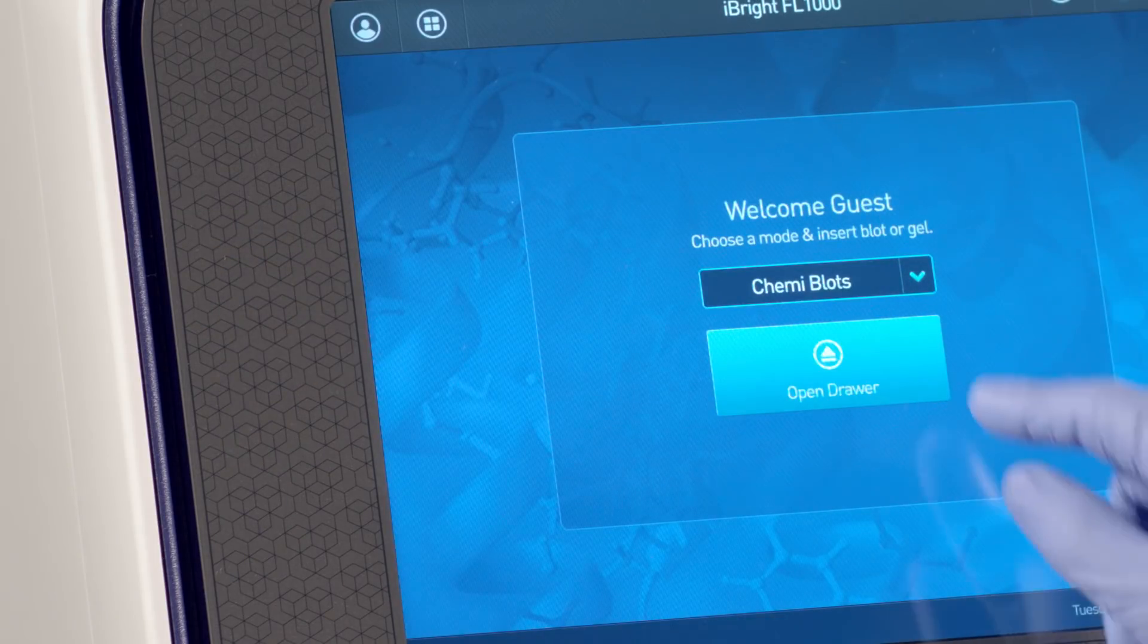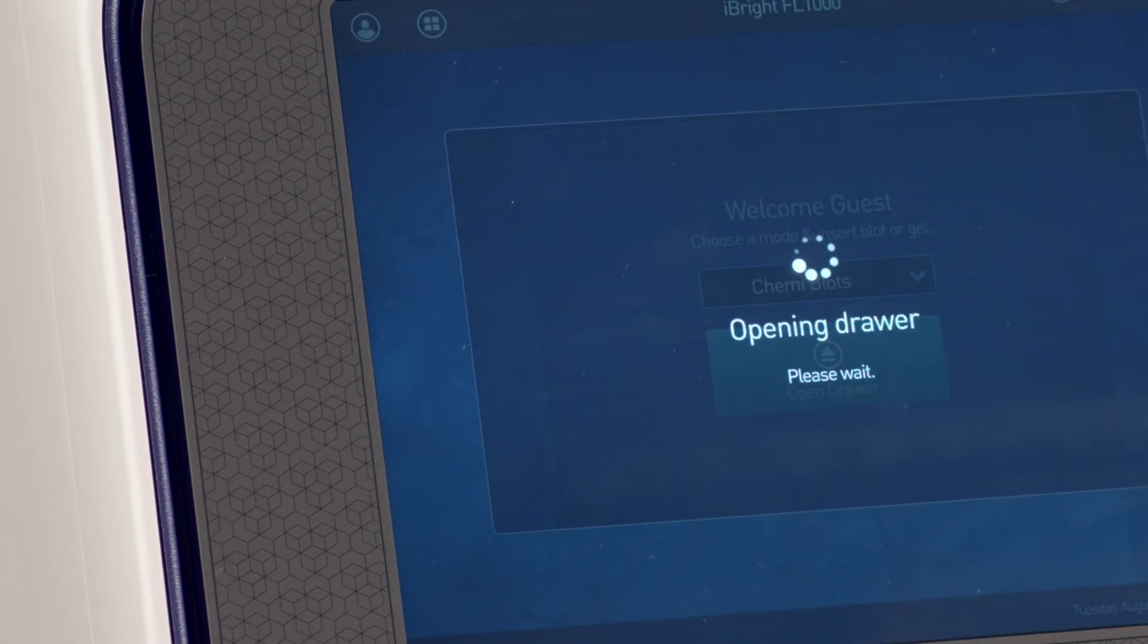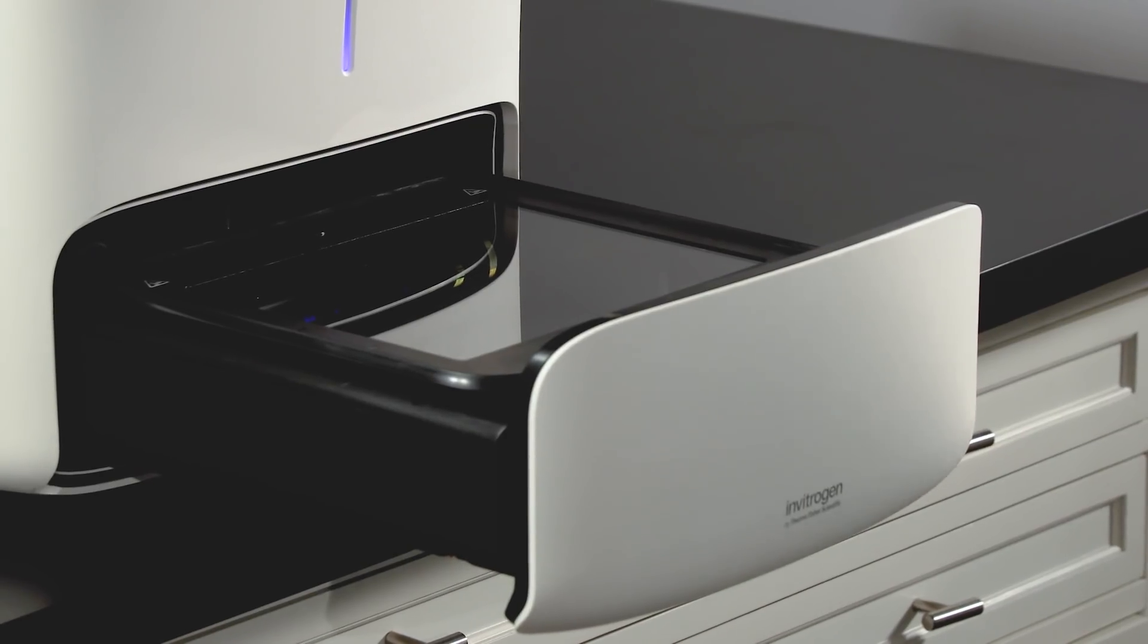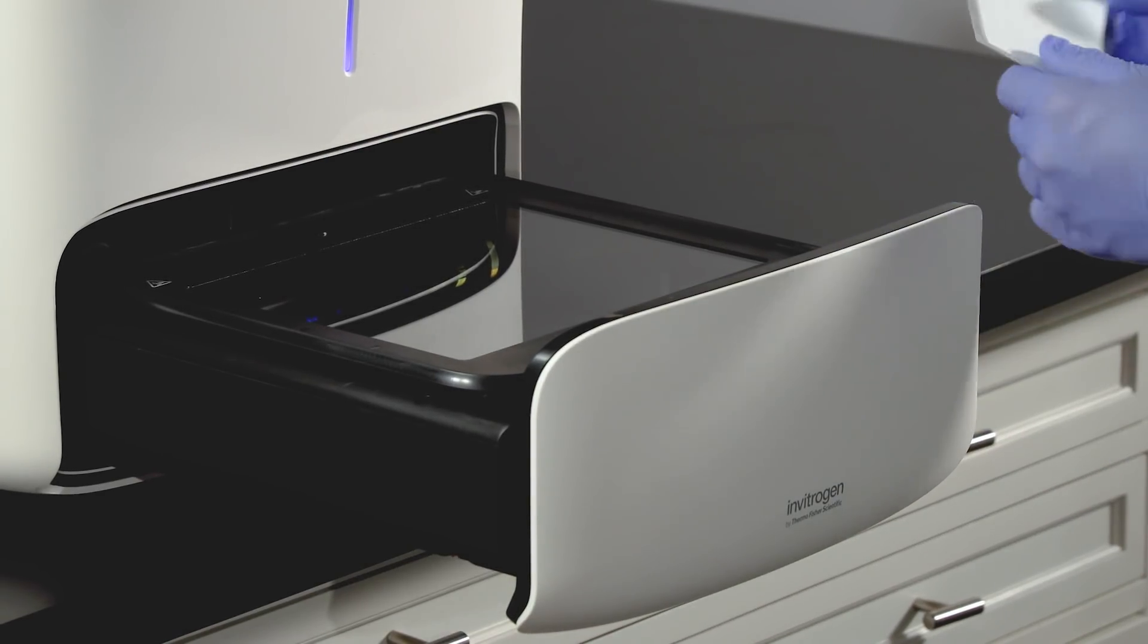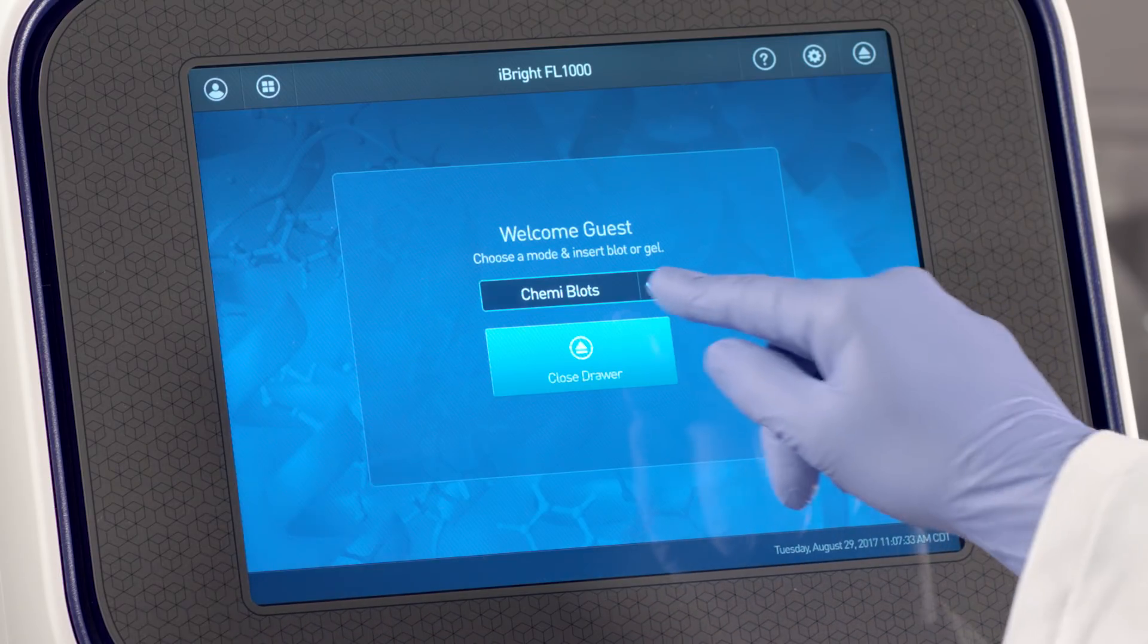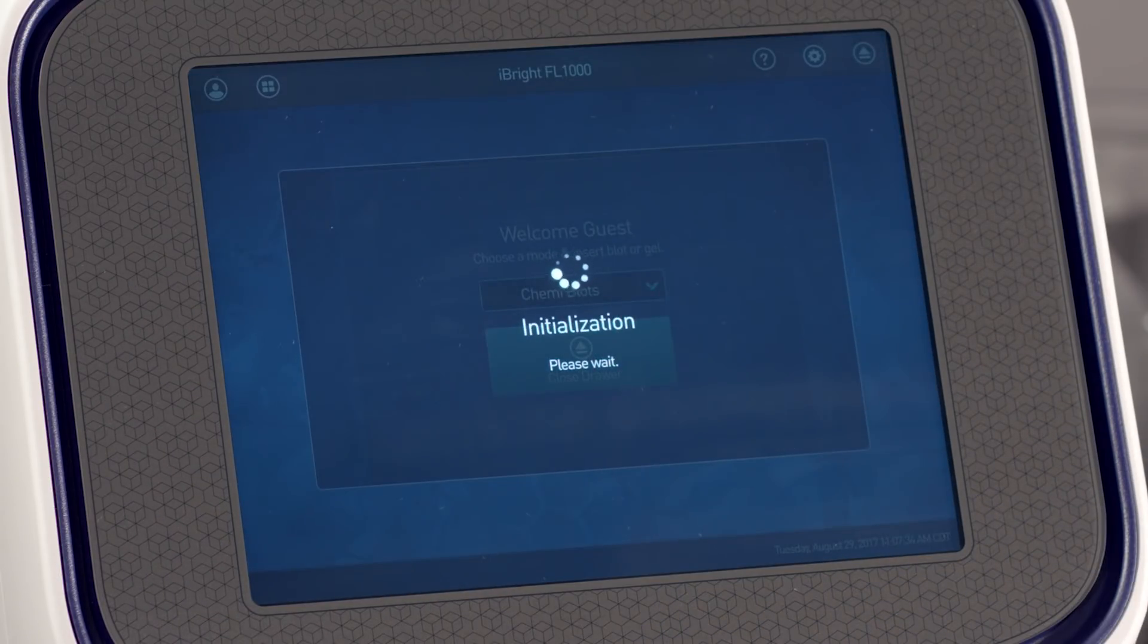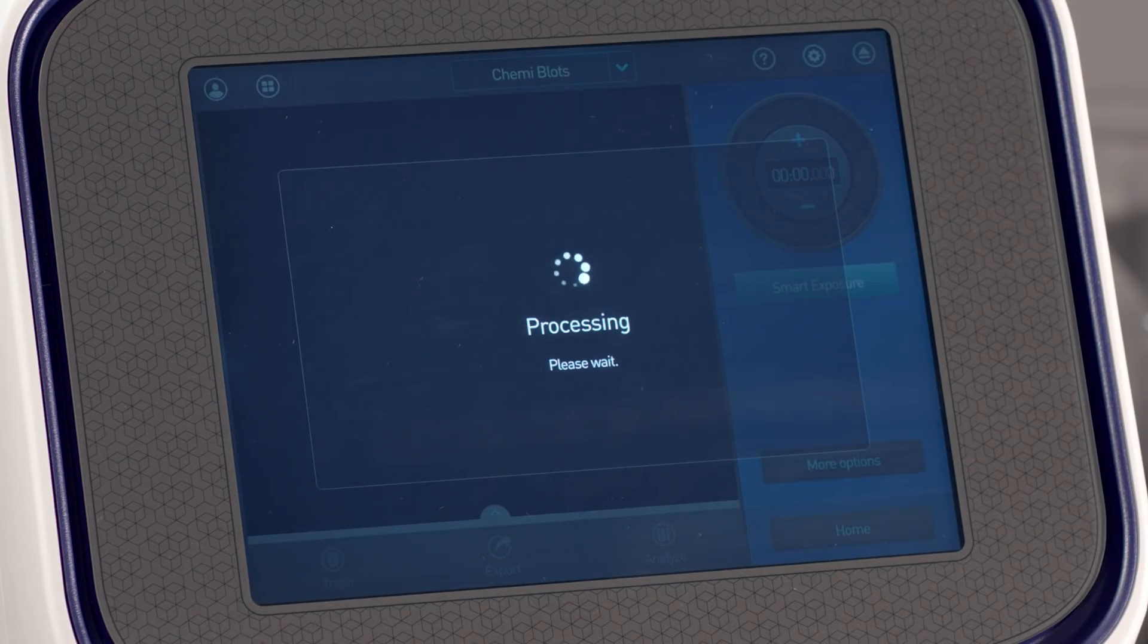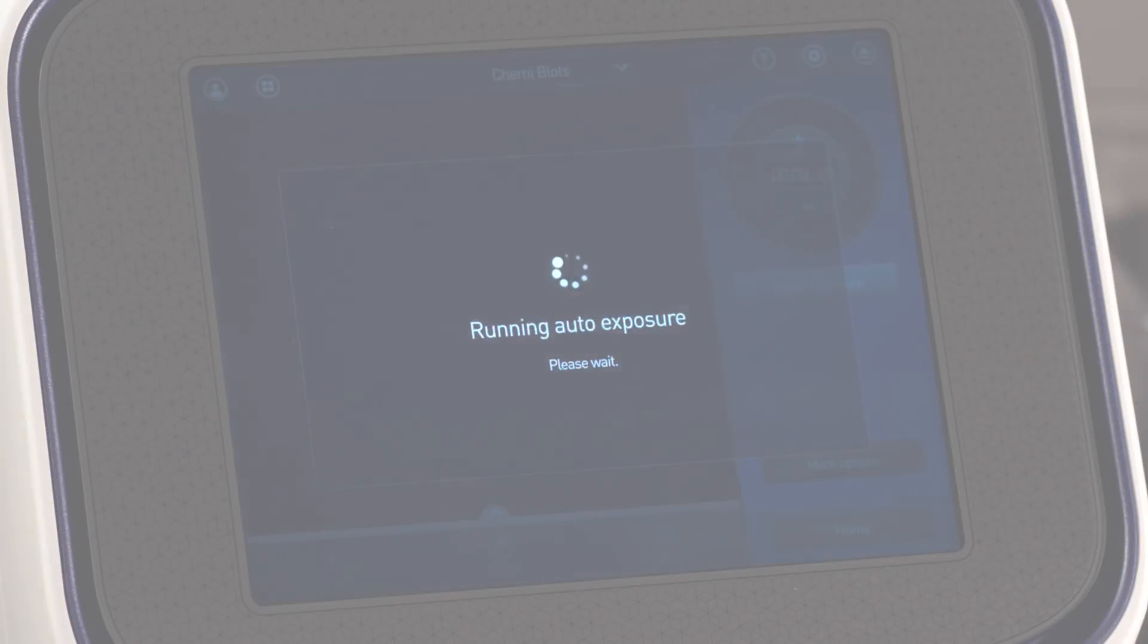Open the sample drawer. Insert your sample. Close the sample drawer. Eyebrite automatically focuses, zooms, and rotates the sample before a live view.